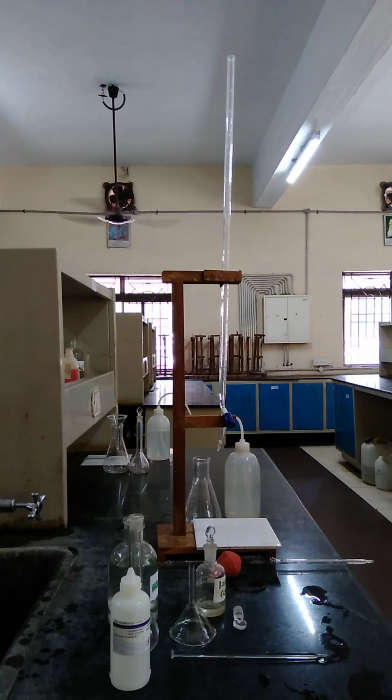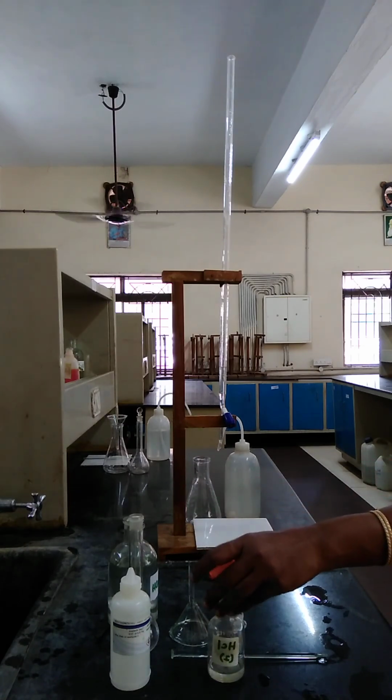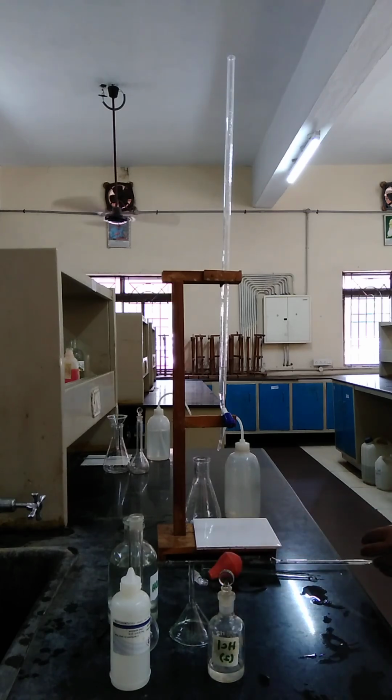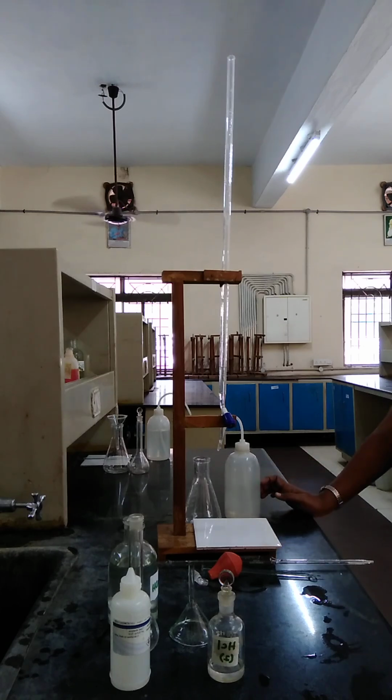Okay. As per the first titration, we can call it the standardization of sodium hydroxide. So the given sample is HCl. Okay. HCl sample they gave, the bottle number is 2. Okay. So whatever the sample given, we are going to find out the normality, the amount of HCl present in the given sample, which we are going to make up to 100 ml.